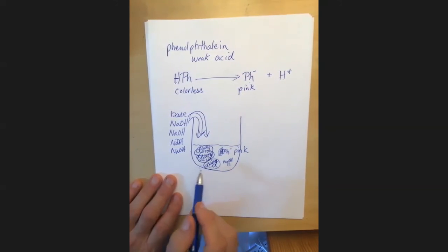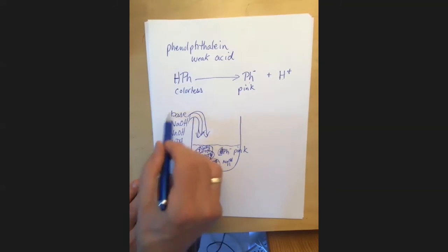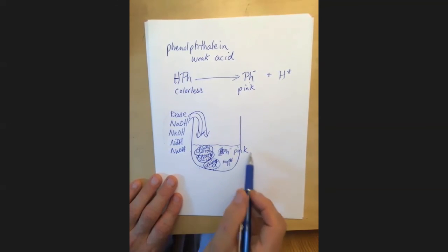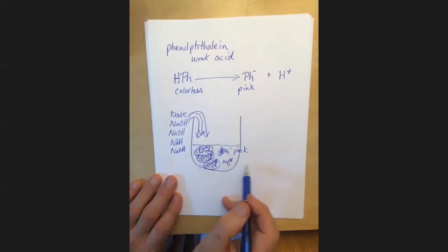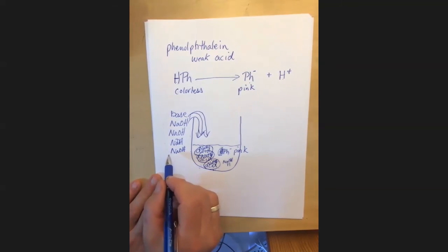And so the titration is we use the compound that we know a lot about to find out something about a compound that we don't know quite so much about. And it uses these indicators. In this case, we've been talking about phenolphthalein, and it's an indicator that changes color from colorless to pink when we remove hydrogen from it, which we use that color change to tell us when to stop adding the sodium hydroxide.